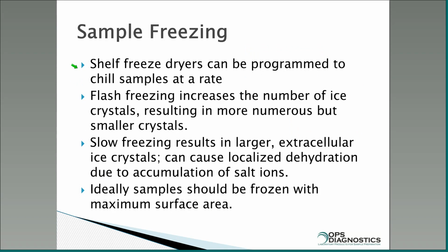So shelf freeze dryers, you can program it. For instance, I will put my couple hundred vials on our shelf freezer, and it will start at 4 degrees, and I'll set it to go to minus 40 over, let's say, a 1 to 2 hour period. Hopefully, at the end of that, if all the vials are flat on that surface, and you give it a chance to really chill down, everything will be ice. Occasionally, if one of the vials is not touching well, it will still be liquid, but that's only 1 or 2 out of the entire run if you're not careful.